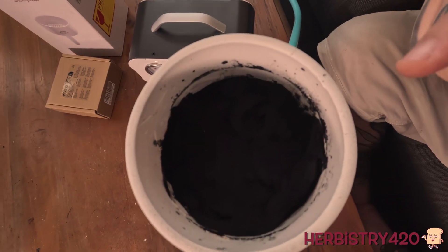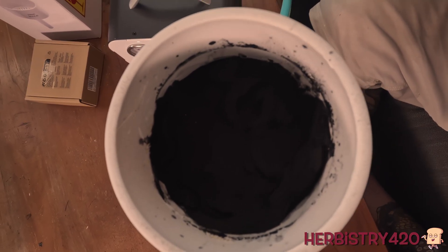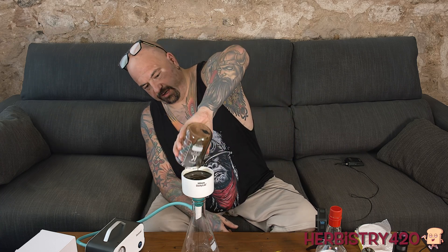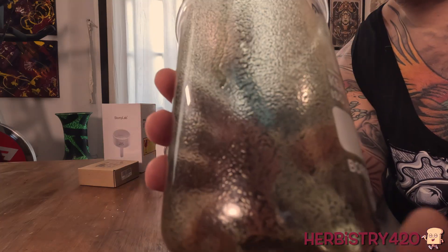Let me grab the GoPro. I'll put it over the filter cake so you'll see what the filter cake looks like. You'll notice the activated charcoal looks very dry right now. When we pour the tincture on top of this and we turn on the vacuum pump, it's going to start to pull everything through. Before we pour the tincture on top of the filter cake, make sure you stir it with your spoon. After stirring, pour it on top. This was about 200 milliliters. Look at the glass — you can see some of this coloring is from the charcoal, but some of this coloring is from the chlorophyll. You can see this really deep green hue. Let's turn the vacuum pump on and watch the magic happen.